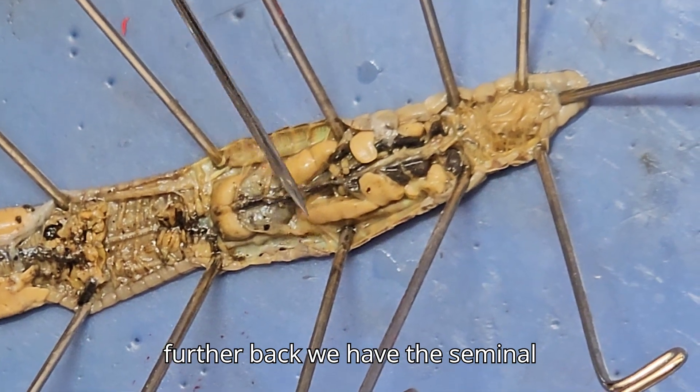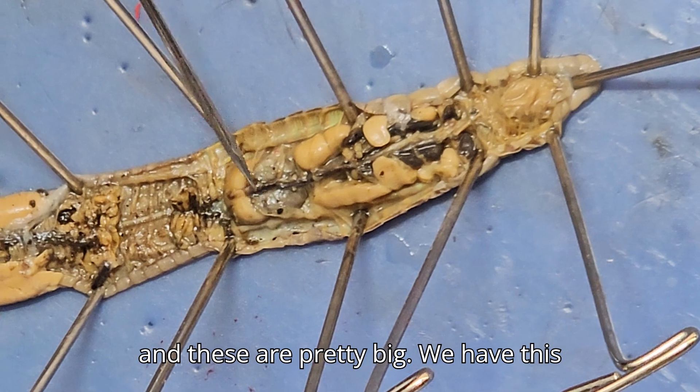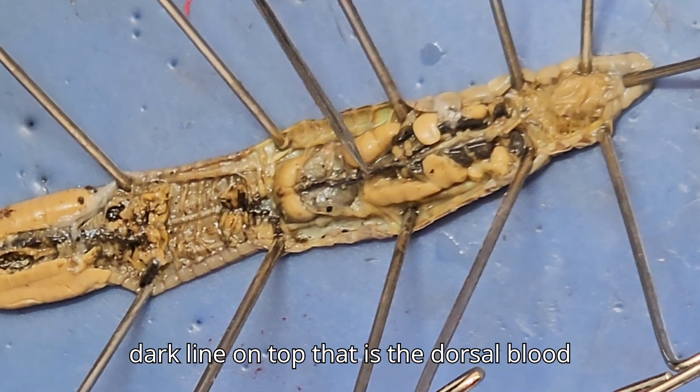A little bit further back, we have the seminal vesicles — usually there's four of them, and these are pretty big. We have this dark line on top; that is the dorsal blood vessel.